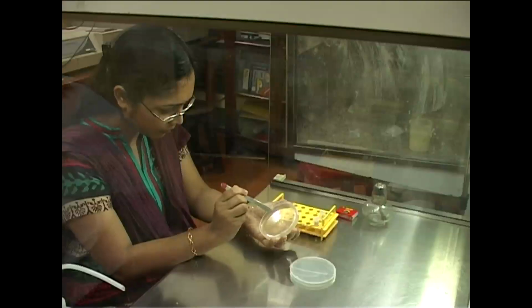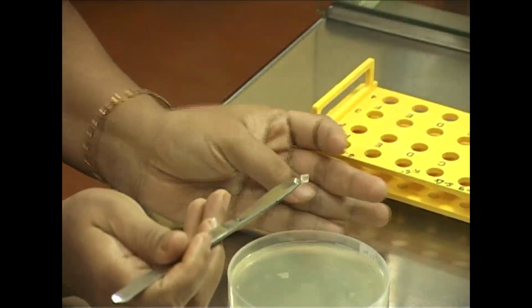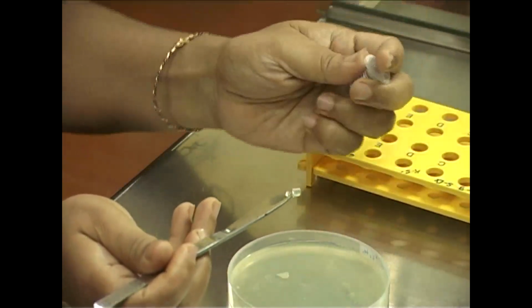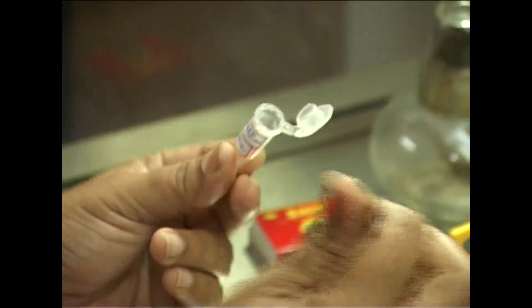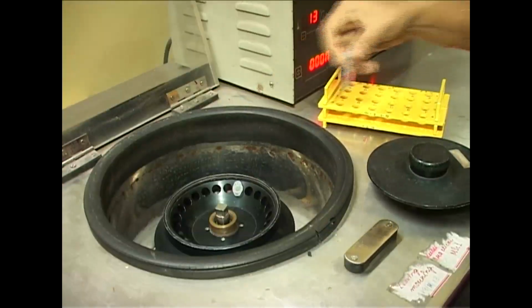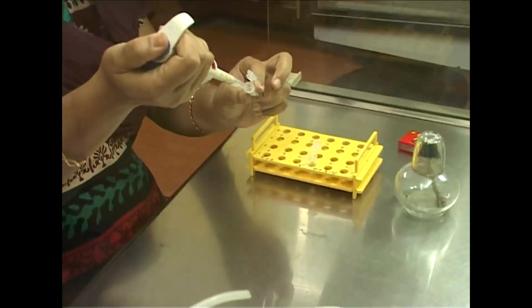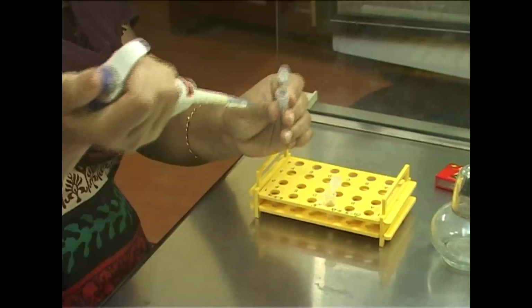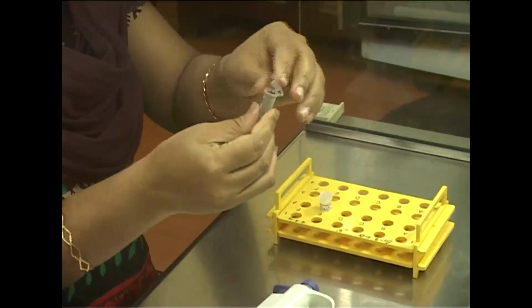Now, if we want to elute the phage from the plaque assay plate, what do we have to do? We have to remove a plug of soft agar containing the plaques. Then we have to place it in sterile saline water, and within 15 to 30 minutes, the phages will diffuse out of the agar, they will come to the saline. Then with a rapid spin, the agar will be precipitated out and the phages will be present in the supernatant. So you collect the supernatant, it is full of T4 phages. You can keep it in the refrigerator indefinitely.